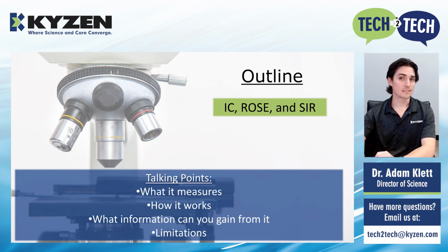So here's a quick outline of the techniques that we're going to be discussing today and the talking points for each. We're going to review ion chromatography, or IC, resistivity of solvent extract, commonly known as ROSE, and surface insulation resistance, or SIR. For each of these analytical techniques, we're going to discuss what is actually being measured. We're going to give a brief description about how the instrument works. We're going to talk about what information you can gain from it. And then most importantly, we're going to be talking about what the limitations are.